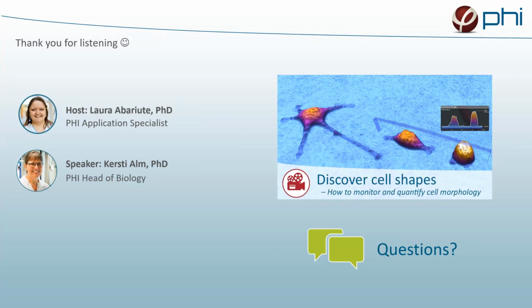So first question is from Sarah from Edinburgh University. What do the morphological parameters mean? There are so many. Are they all relevant? Okay, actually, that is a huge scope on that question. So for what the parameters mean, every single one of them, I will actually refer you to the handout, because there is a thorough description of every parameter.